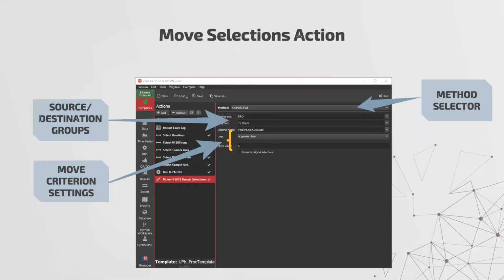And by doing that, you know that if they've passed tests that you've set based on criteria, then you don't really need to check those. You definitely should check them, but they require much less time. But by putting the ones that do need to be checked in a single group, it makes it much easier to look at them quickly, because you've already identified the ones that need to be inspected, maybe adjusted.